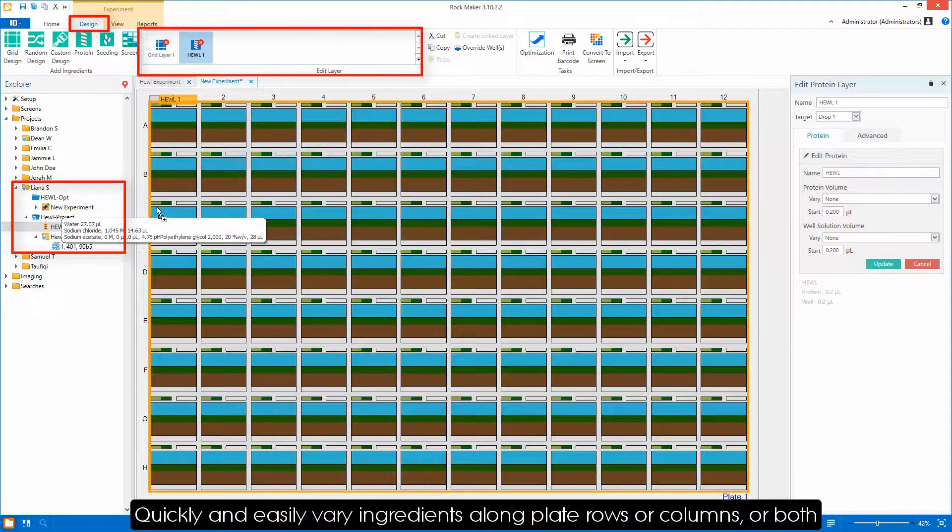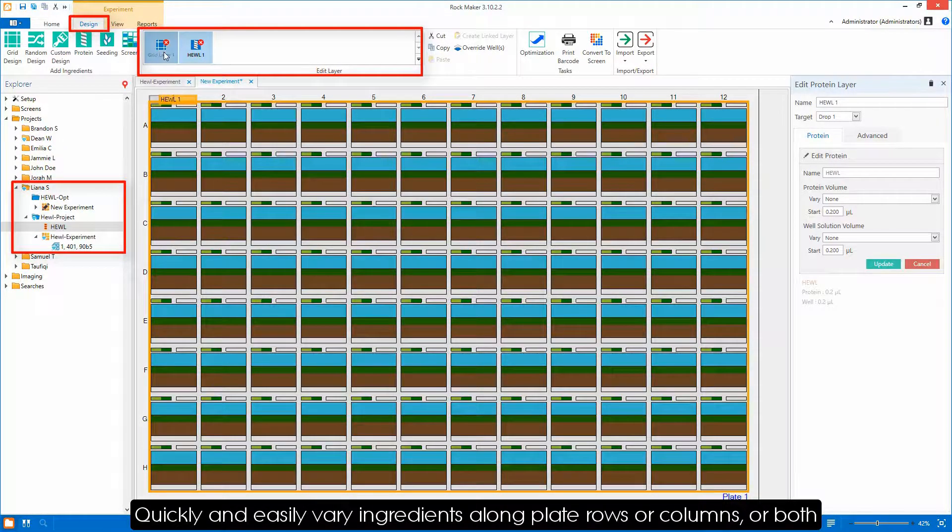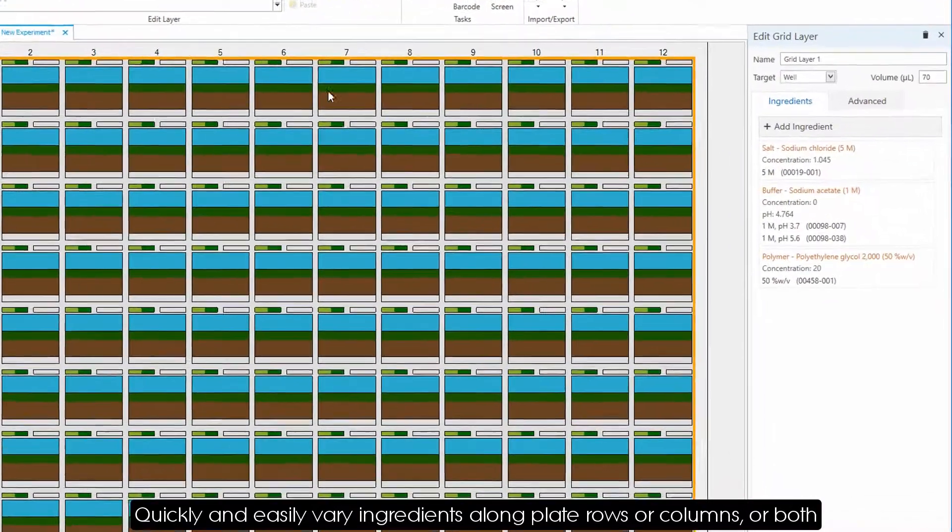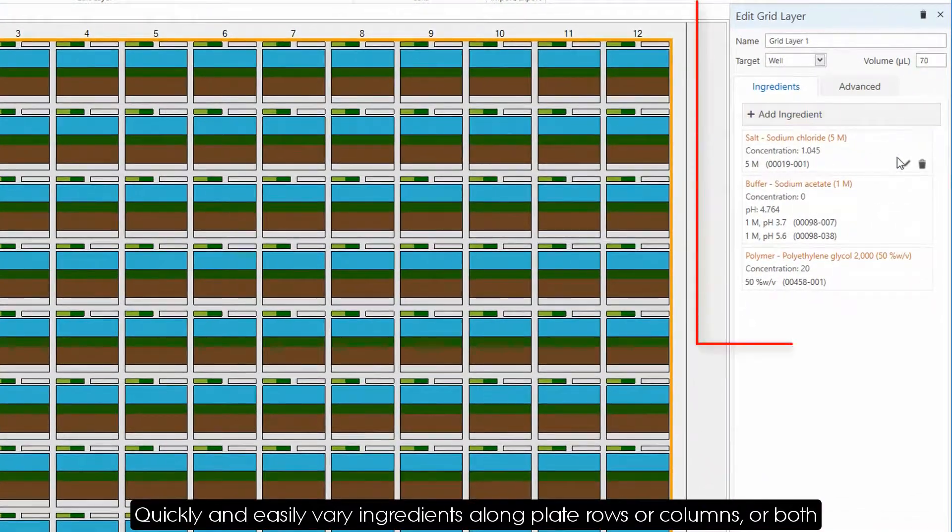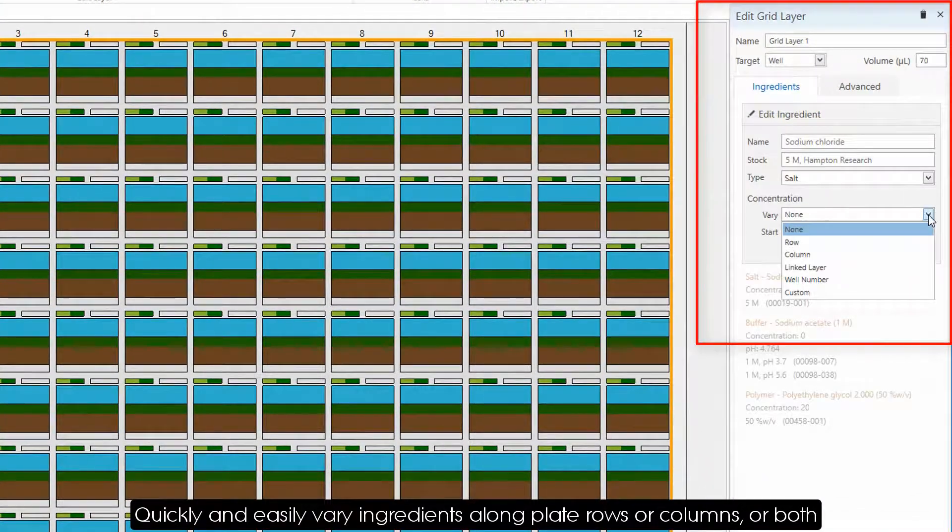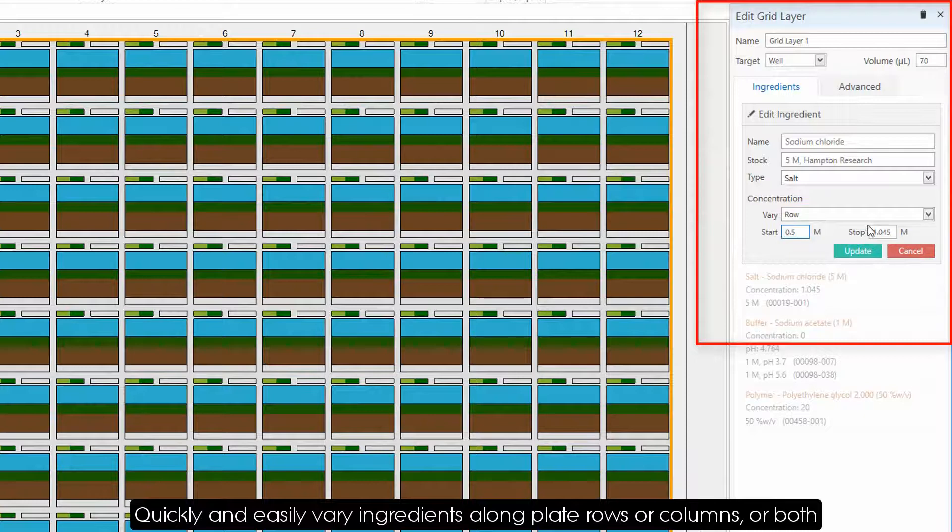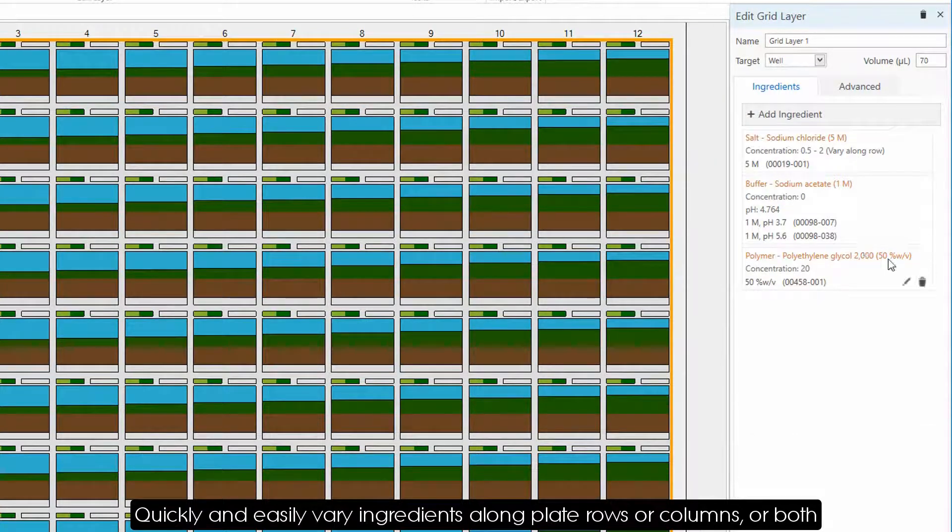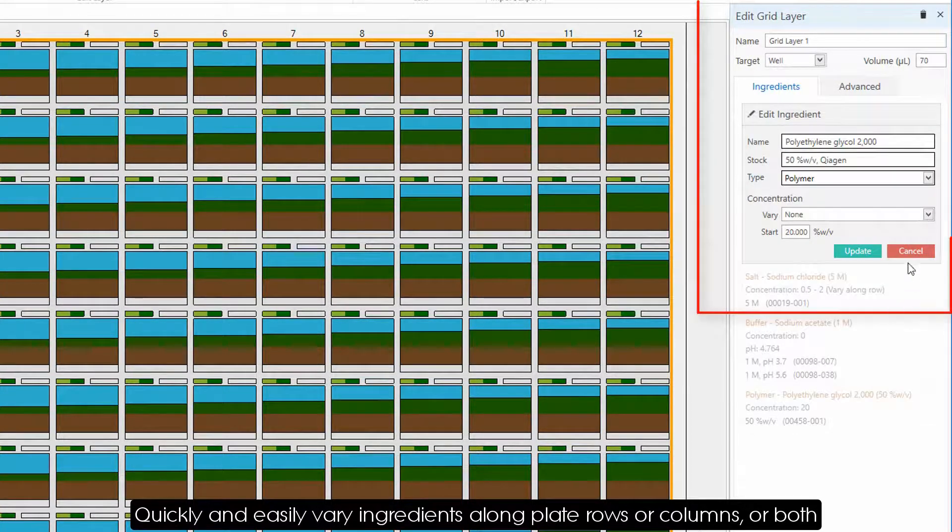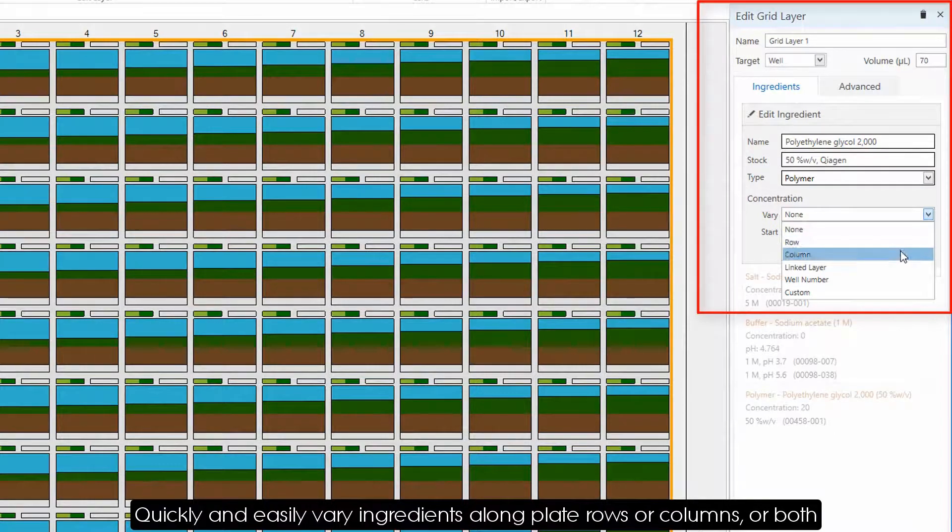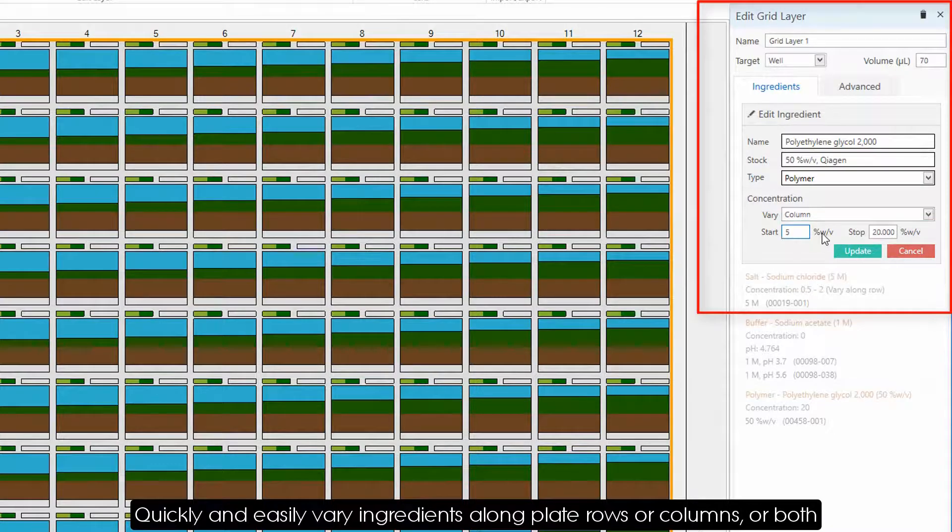You can now quickly and easily vary the ingredients of your choice along rows or columns, or both. In this experiment, we varied the concentration of the salt along the plate rows and the concentration of the polymer along the plate columns.